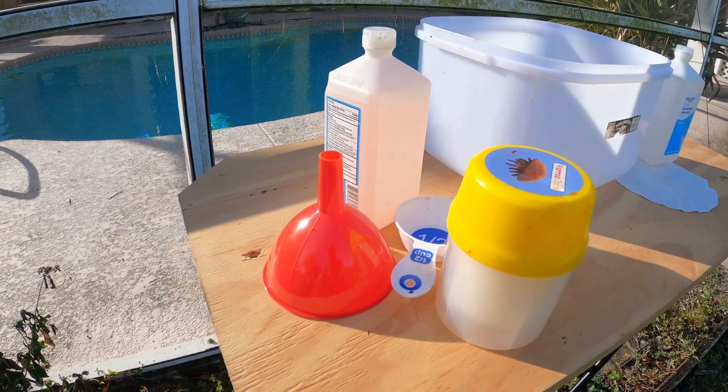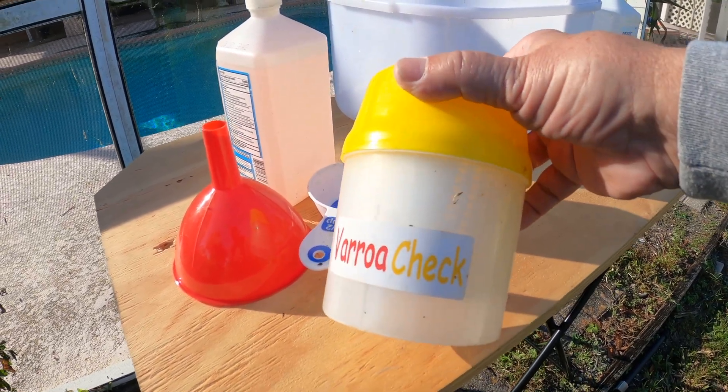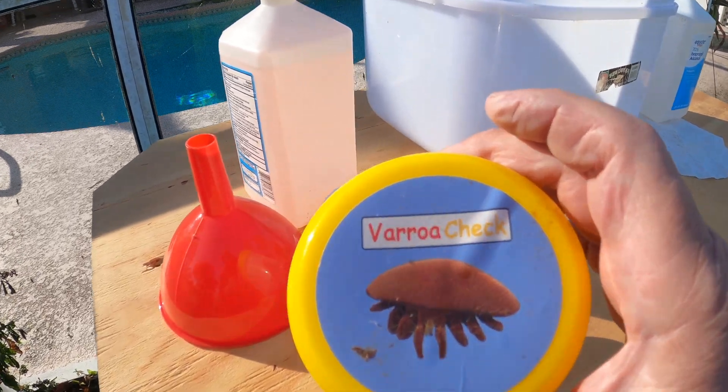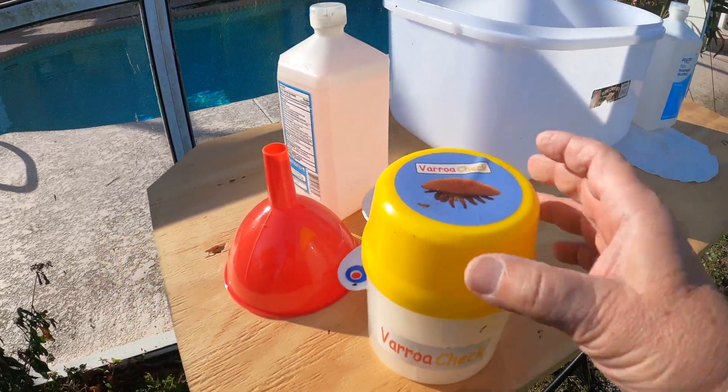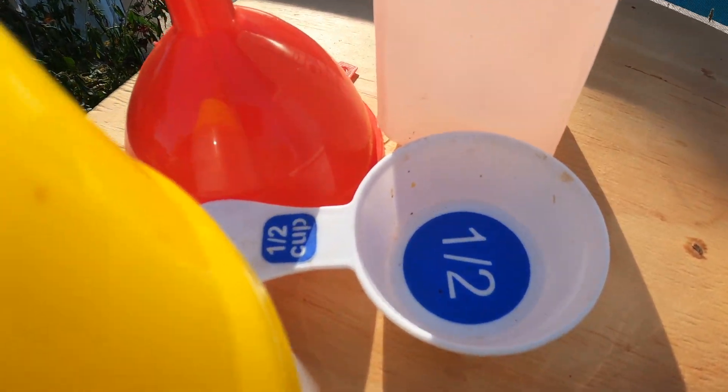Before you pull your frame, have all your equipment ready. You should have something like this Easy Checker — they're inexpensive on the internet. It has a line inside; you fill it up to the line with alcohol. They say you should use 90%, but 70% isopropyl alcohol seems to work fine. It has a scoop that holds half a cup of bees — half a cup equals about 300 bees, which makes for an accurate sample.